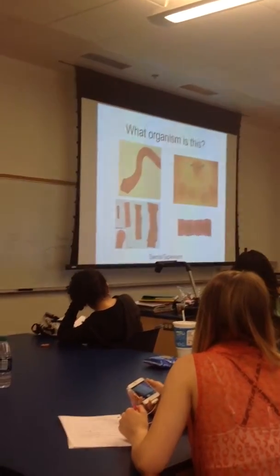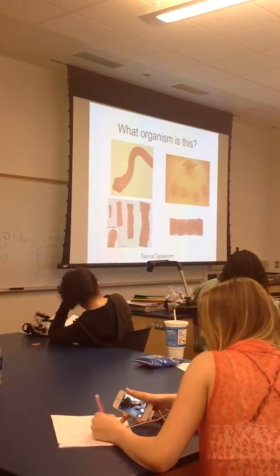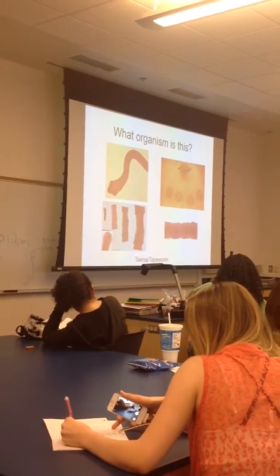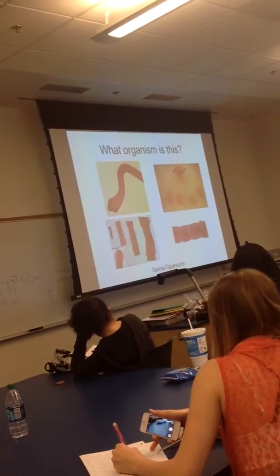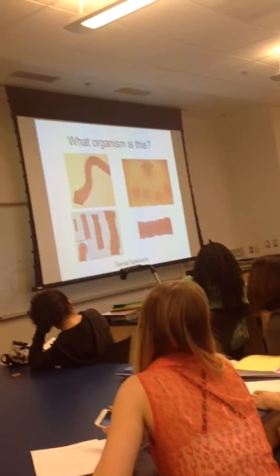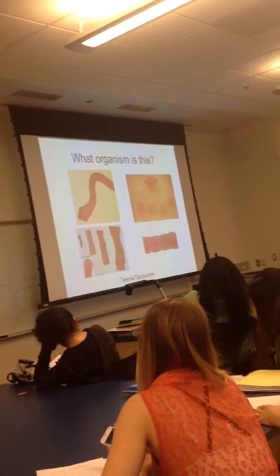This is the magnification of the scolex. We have these little hooklets. This is what burrows into your intestinal wall. And then we have the suckers that help with attachment. So we have this very obvious scolex, and we have all these different segments that you had to look at: your scolex, your immature, and your two mature sections.